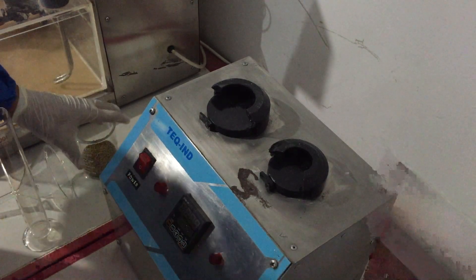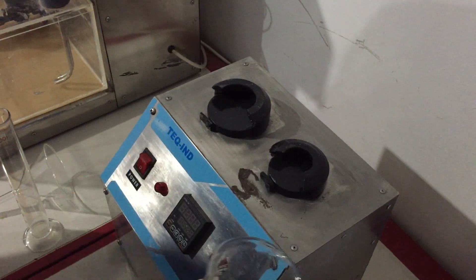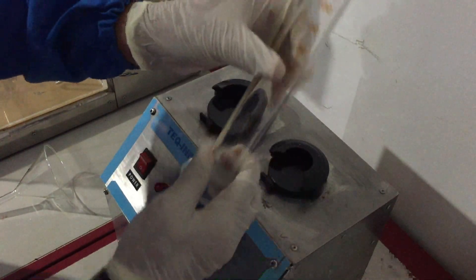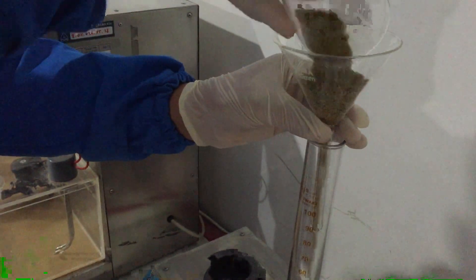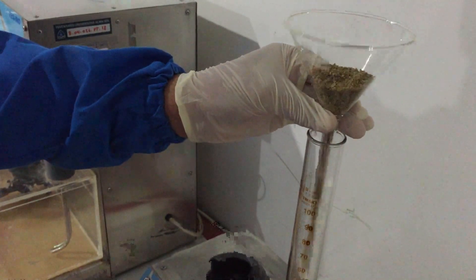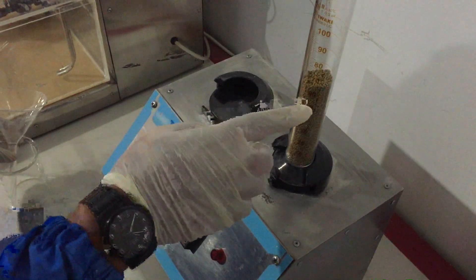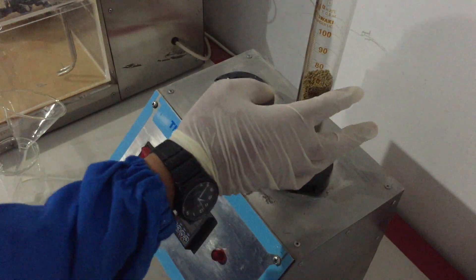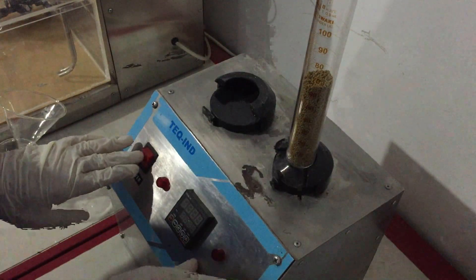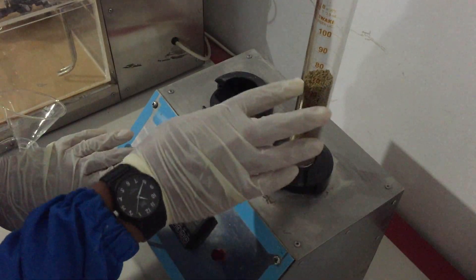Baik, untuk percobaan berikutnya yaitu adalah uji pengetapan pada granul ekstrak etanol daun kelor sebanyak 25 gram. Disini kita akan menggunakan alat ini — masukkan gelas ukur dengan ukuran 100 ml. Kemudian kita masukkan granul. Kita catat sebagai volume awal. Disini volume awalnya sekitar 68. (For the tapped density test: 25g of granules are placed into a 100 ml graduated cylinder. The initial volume is recorded as approximately 68 ml.)